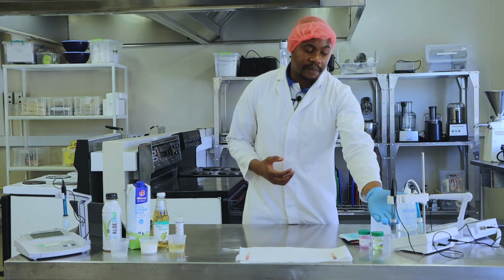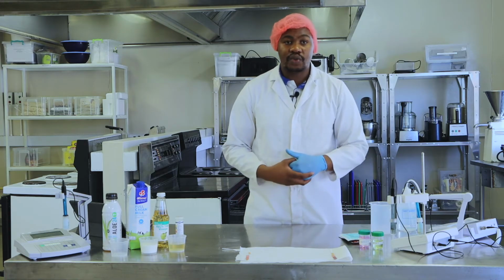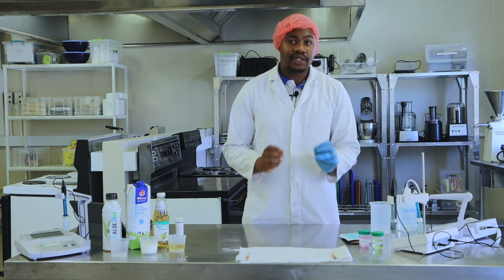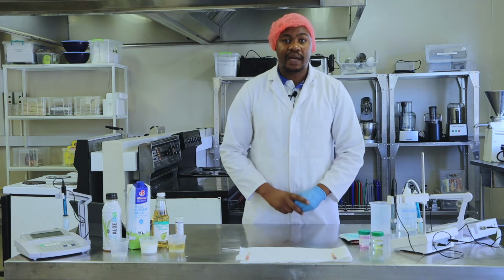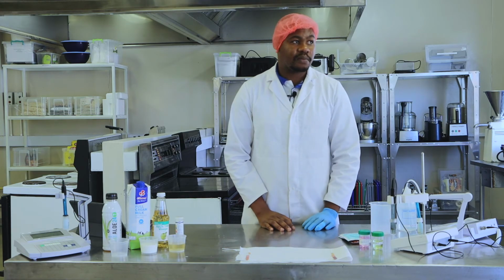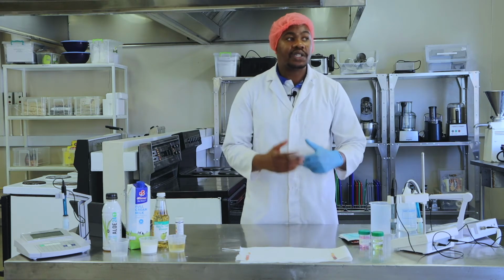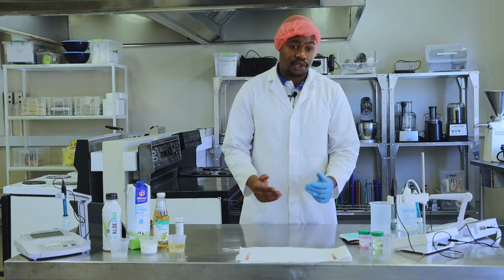The probe is inserted into the food product to measure your pH based on the ions that are present. Remember that in terms of pH, you've got the OH minus molecules and the H plus molecules, which give a charge to your food product or solution.